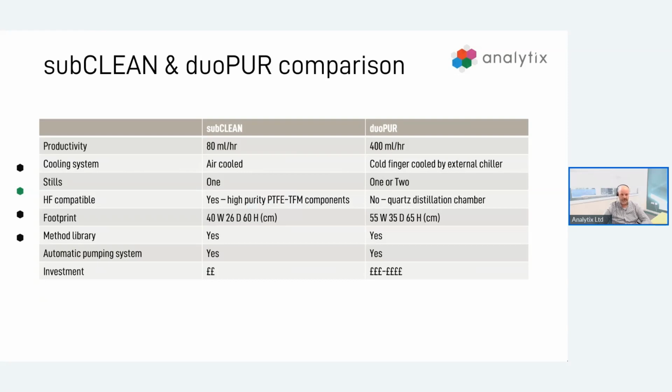The way that it operates is to essentially use a peristaltic pump to dispense these acids from their containers into the vials that are going to be holding your sample for digestion. So this peristaltic pump has a set dispensing speed of 1.5 mils per second, so it's very fast, but it is very controlled as well, with an accuracy greater than 99%.